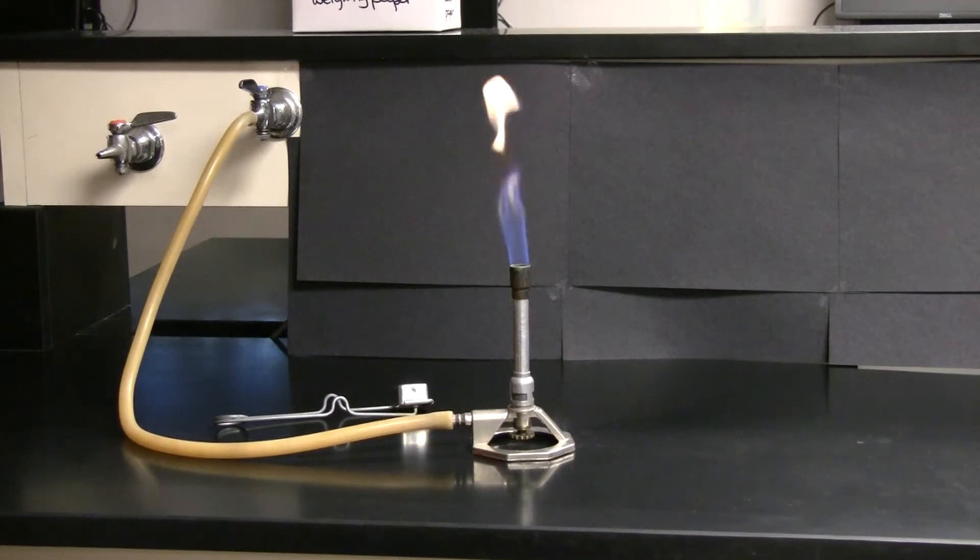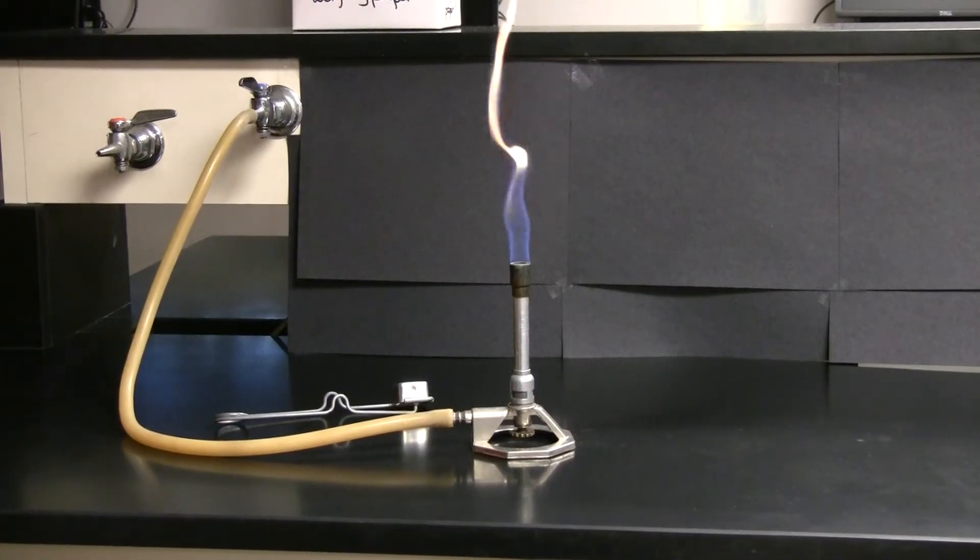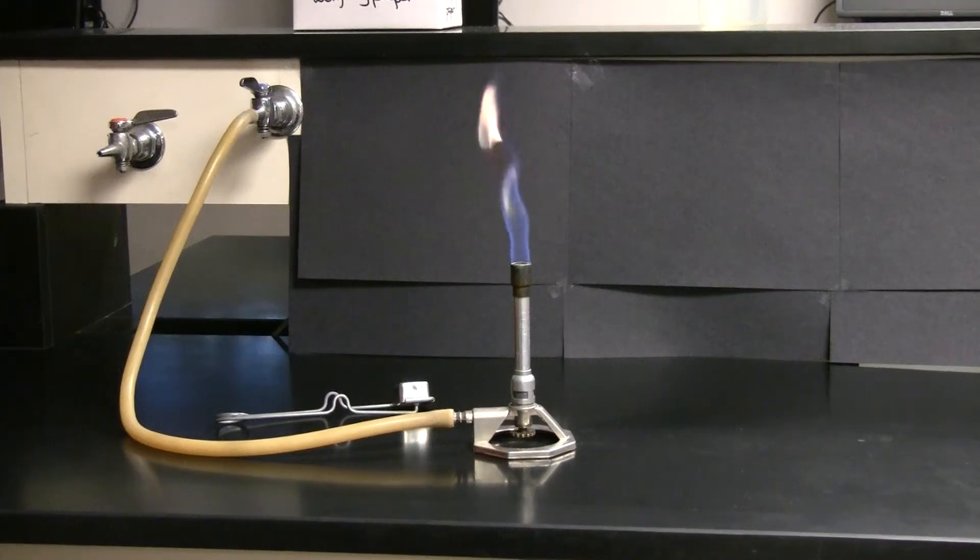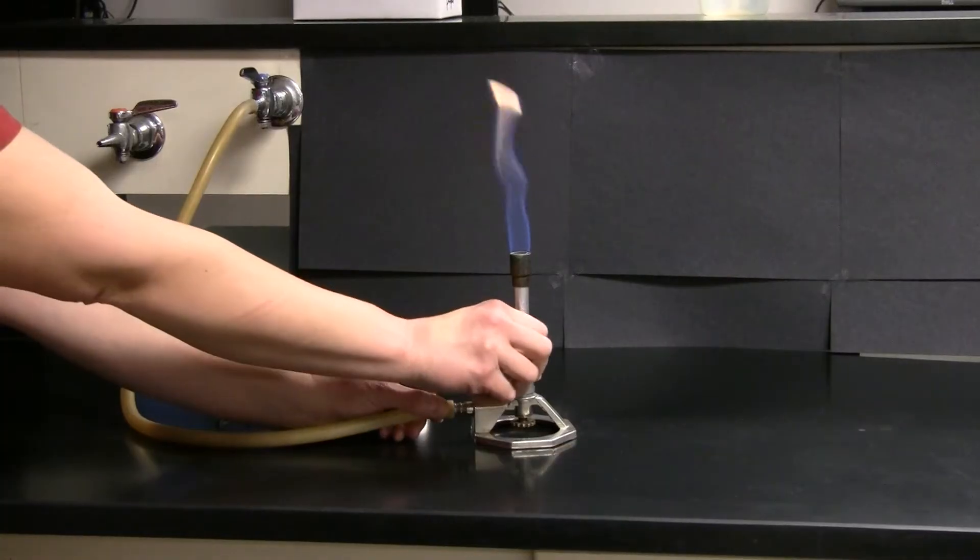We want the flame to be two to five inches in height and it should not be yellow. You should see an outer blue cone and a lighter blue inner cone as well. To make this adjustment, use the air inlet valve on the barrel of the Bunsen burner.